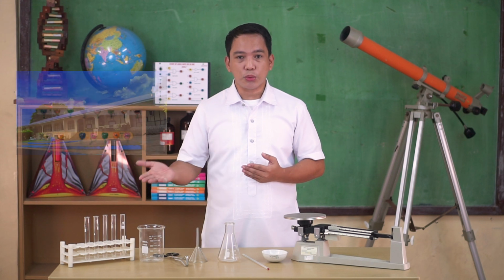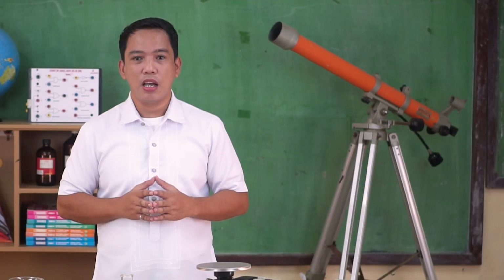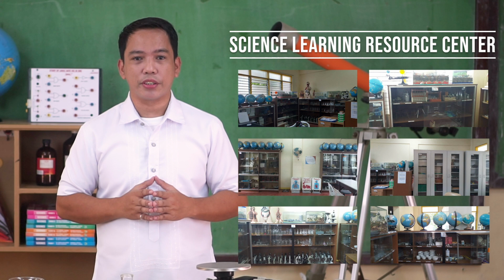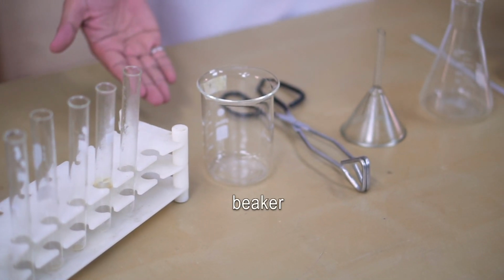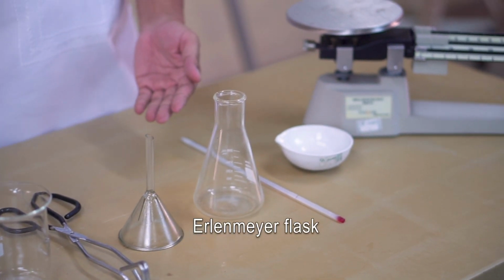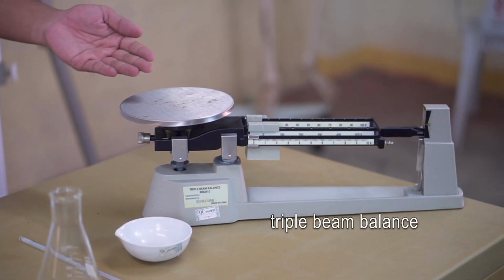Conducting experiments in chemistry cannot be possible without the use of specific apparatuses, be it in a school, in industry, or field site. For a high school laboratory, we seldom find sophisticated equipment, unlike in specialized laboratory facilities. However, common apparatuses are available in the science learning resource centers of schools. These may include test tubes, beaker, tongs, funnel, Erlenmeyer flask, thermometer, evaporating dish, and triple beam balance, to name a few.